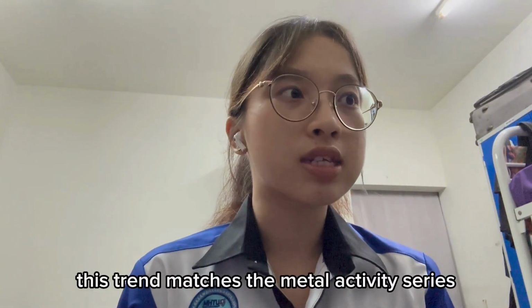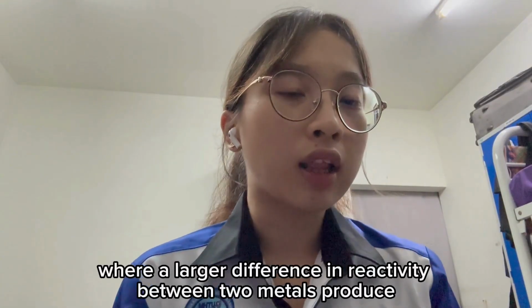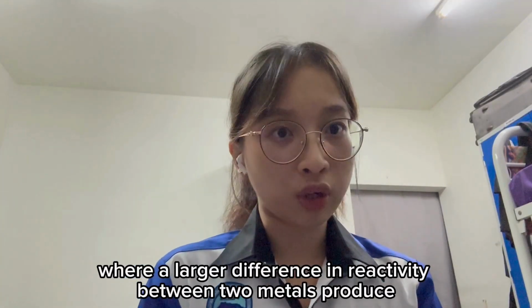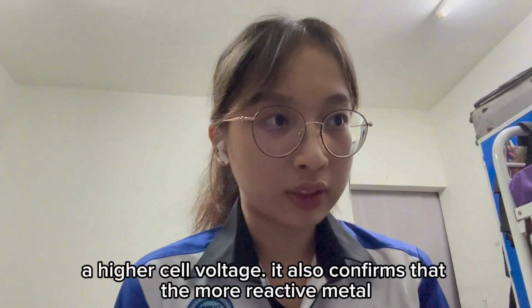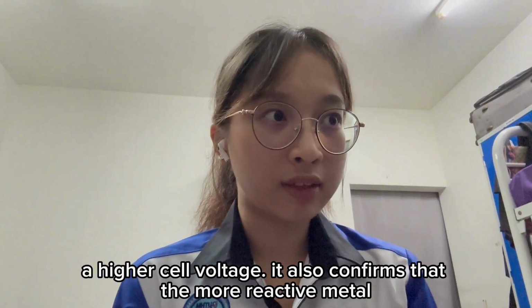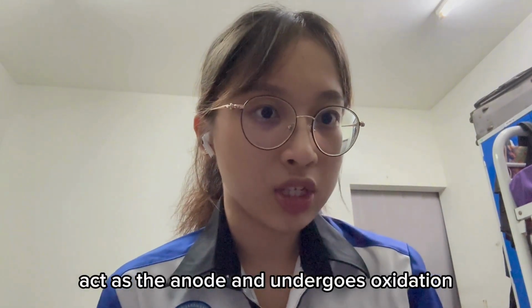This trend matches the metal activity series, where a larger difference in reactivity between two metals produces a higher cell voltage. It also confirms that the more reactive metal acts as the anode and undergoes oxidation.